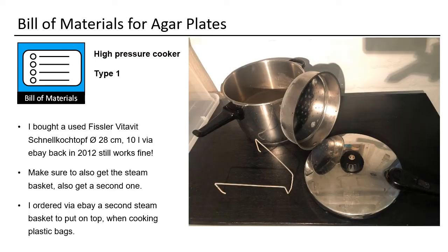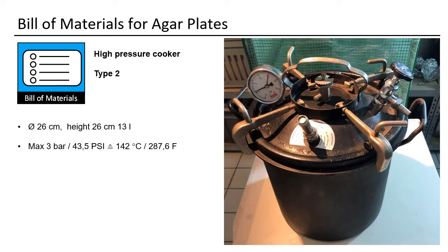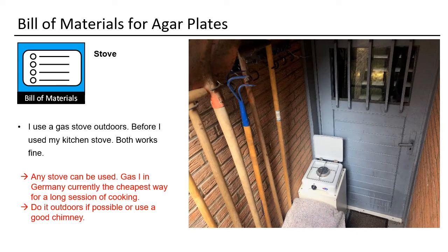For cooking, I use two devices. A standard kitchen pressure cooker. Diameter is 28 cm. Capacity is 10 liter. I always use two steam baskets. This pressure cooker is a little bit bigger and goes up to 3 bar. It takes a little bit more time to open and close it, but works great. I mainly use it for grain and wood cooking, because I can fit more into it. I got it very cheap second hand. I always use gas for cooking, as it is the cheapest way. Cook outside if possible. Always regard the safety requirements.